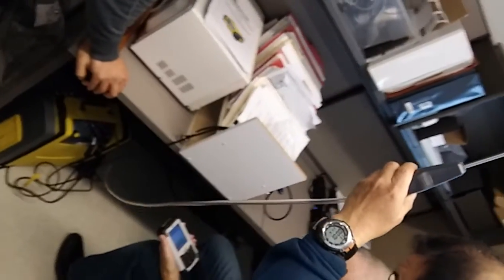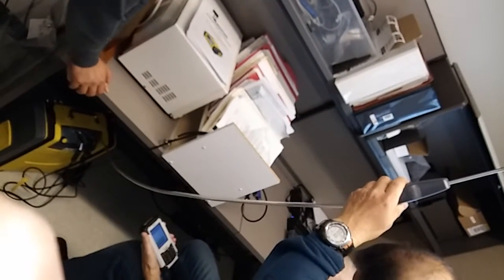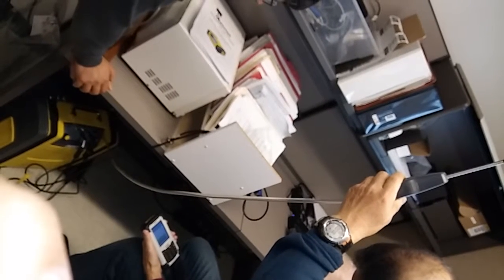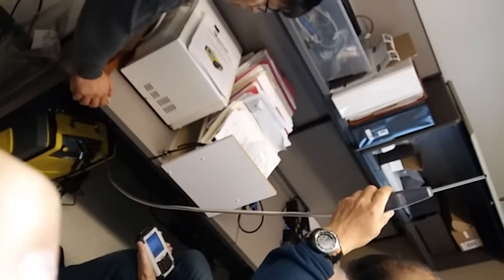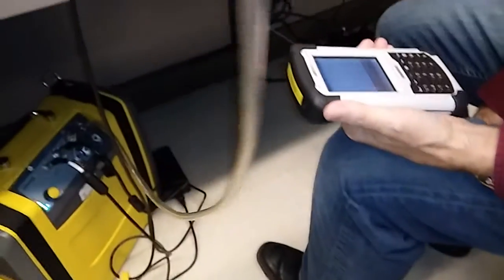Didn't hear the fan on before. Now I hear the fan on. Well, it's just showing the spectrum.